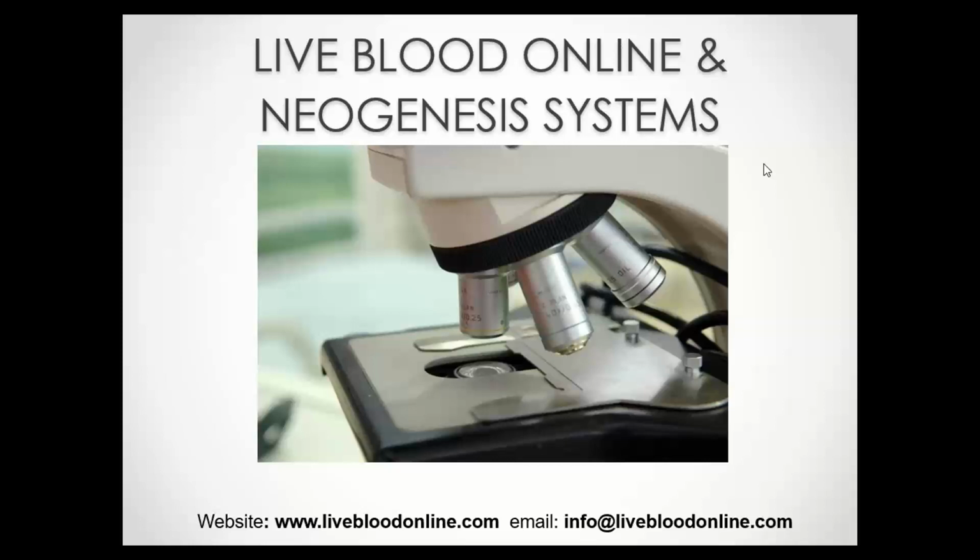Well, yes, absolutely. Those suppliers are invariably not involved in live blood analysis at all. They're not involved in training for live blood analysis, and they certainly don't use it themselves. So they simply don't know what the specifications are, and they're assuming that if you're able to do dark field with a microscope, it should be suitable for live blood analysis. But based on how we've been trained, and from what we've actually seen in samples, you need a very particular type of microscope to be able to properly analyze live blood samples.